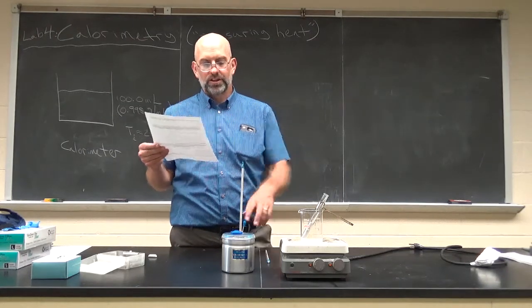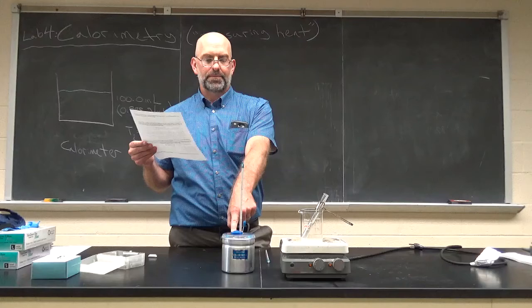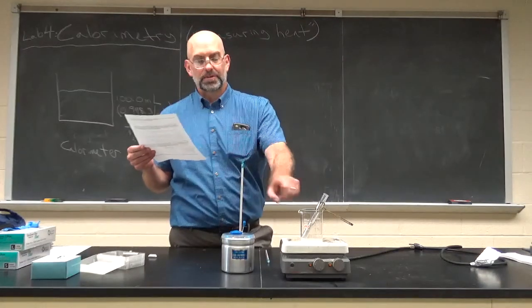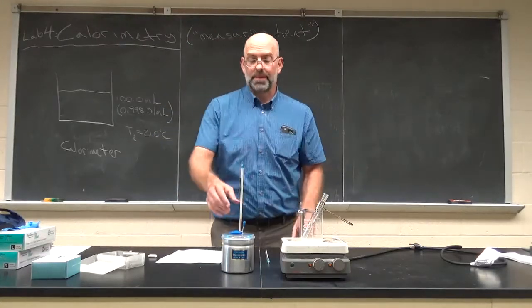Oh yeah, you need the initial temperature of this water in here too. So the initial temperature of this is going to be about 100. The initial temperature of the water is going to be about 20 or so, 19. So make sure you have those two initial temperatures. You have to have those two. If you don't get those two, that's bad.